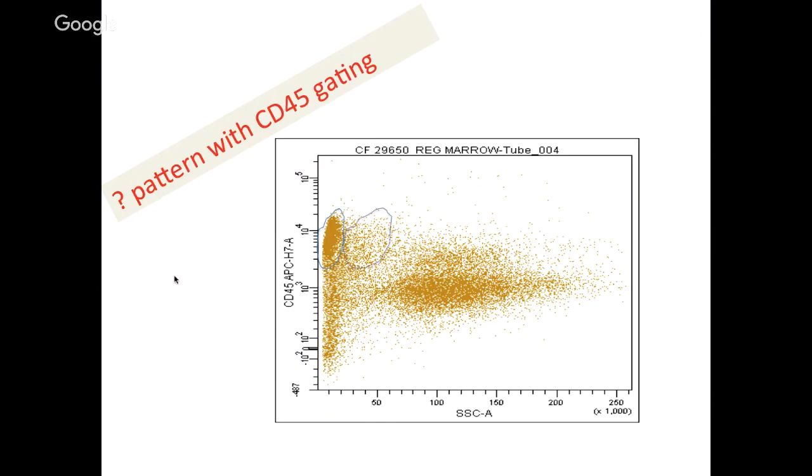Now this second population is monocytes, which has some granules. These are the myeloid cells. The top one is the mature neutrophils, and the low ones are the immature myeloid precursors. And this area is the area for progenitors. When I say progenitors, it basically includes all your stem cells, blasts, hematogones.